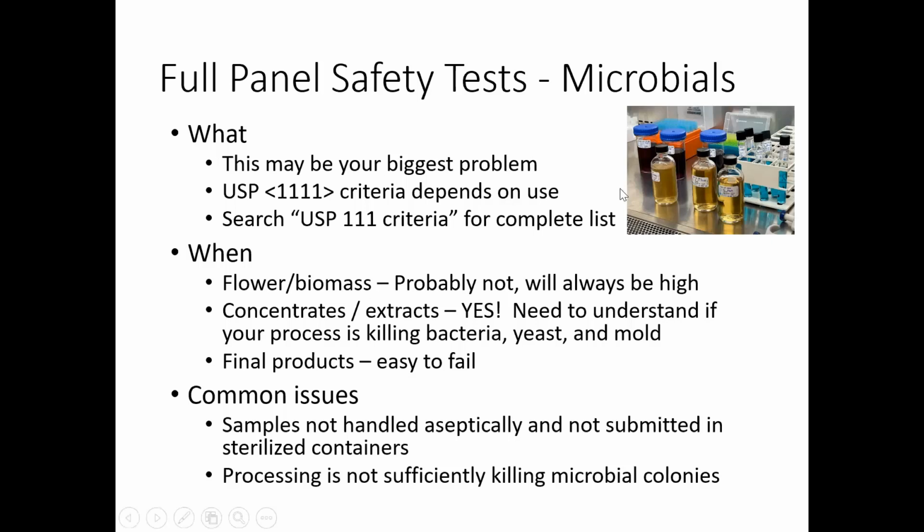And that's probably one of the more common issues, is that we'll see small amounts pop up, and it's usually because of the containers. People just not realizing that they needed to sterilize those as well. And then the other common issue is just things not being heated enough, or a lot of things like more of the raw processed material like keef. If you're not keeping that in the freezer, then you will get an enhancement of those microbial colonies as well. So really the thing to do here is to test some and follow the data.